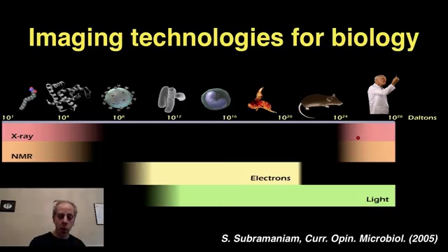During this video, we are interested in viruses. And then we're going to be talking about nanometers or angstroms scales. And in particular, what we're going to use is not light, we're going to use electrons to acquire our image because we are at a very small scale. Again, in the orders of nanometers and angstroms.